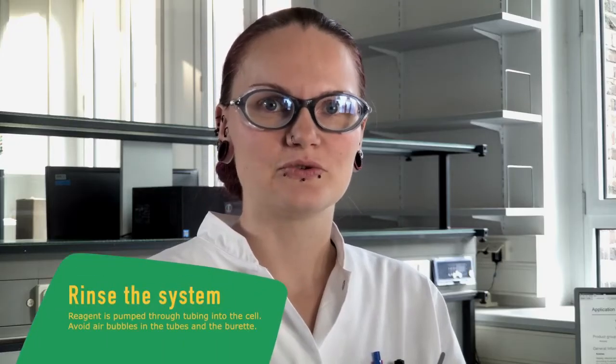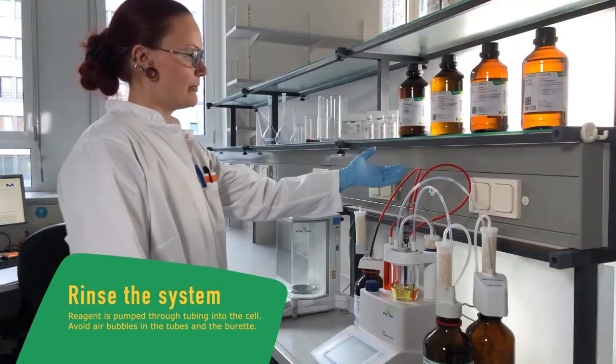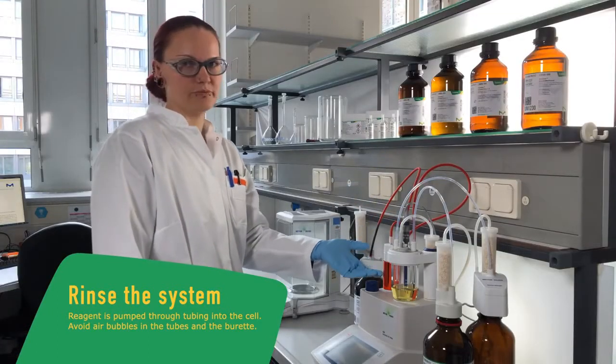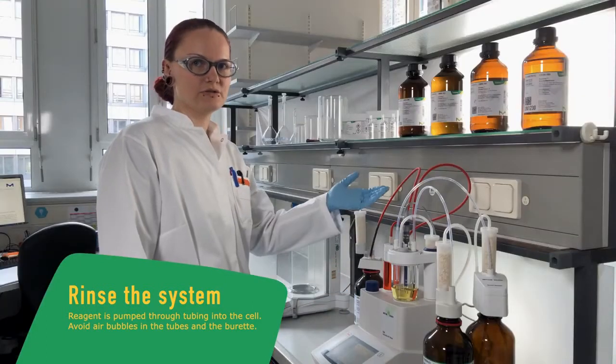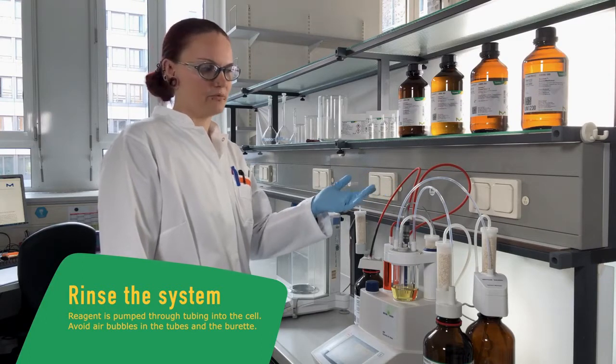The first step is to rinse our system twice with our reagent to make sure that there are no air bubbles in our tube or the burette, and because the concentration of the reagent in the tube may change due to incoming humidity or evaporating solvent.